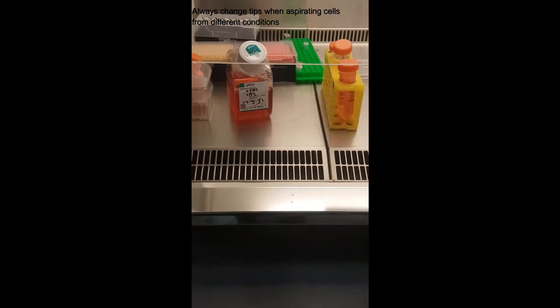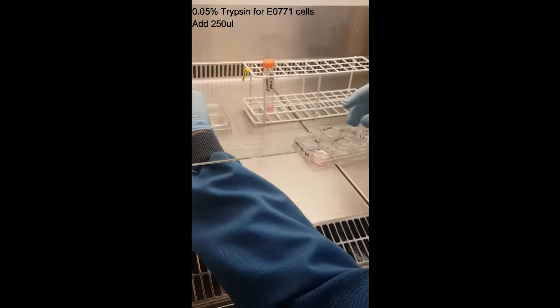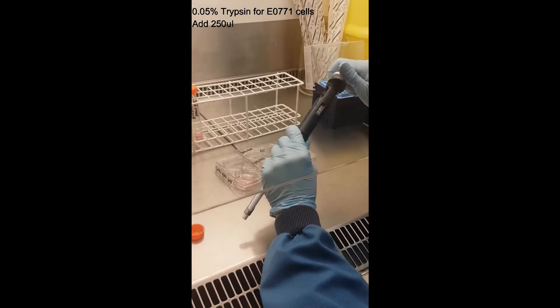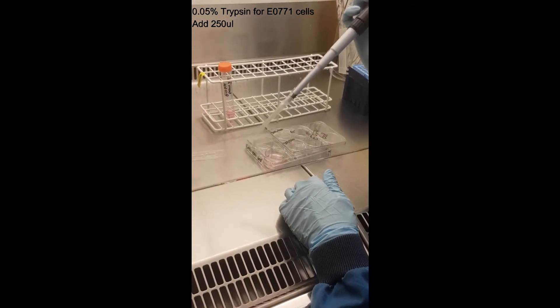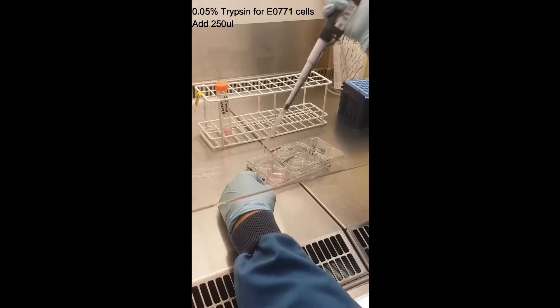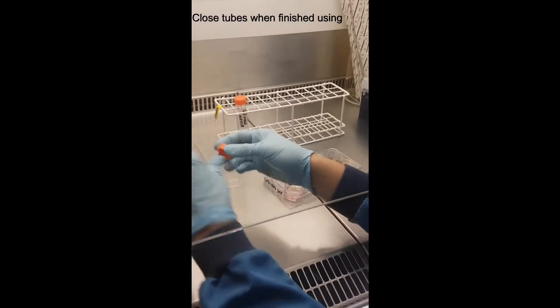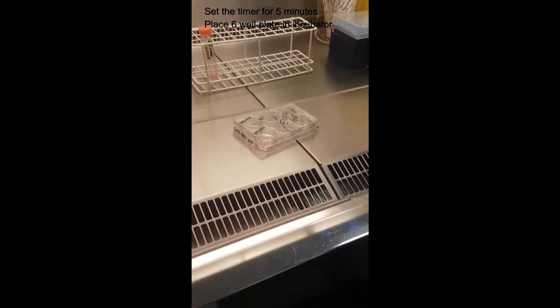That was the washing step. Now we use trypsin — for E0771 it's 0.05% trypsin. For the 6-well format, we use 250 µL. It's not a strict number, but it's enough to cover the cells and convenient because after the wells we will add 750 µL to make 1 mL total for counting. Add it in the center of the well, move the tip carefully, keep it clean, close it again, and set a timer for five minutes.